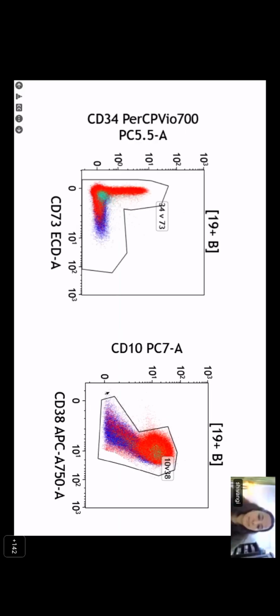Yes. Again, this is a very important plot, CD10 and CD38. So what do you think about the CD10 and CD38 expression of this blast, our CD10 positive blast? CD10 is bright positive, and even CD38 is very homogeneous. So it looks like CD10 and CD38 are co-expressed, and finally both of them are lost and this becomes a mature B cell. So again, the pattern that we discussed seems to be maintained even here.